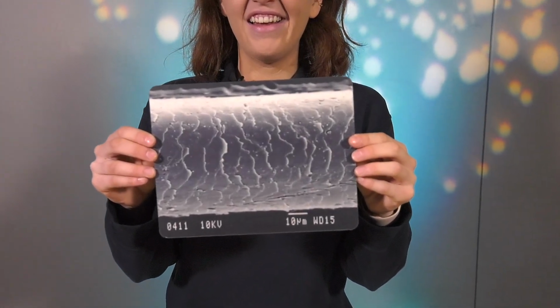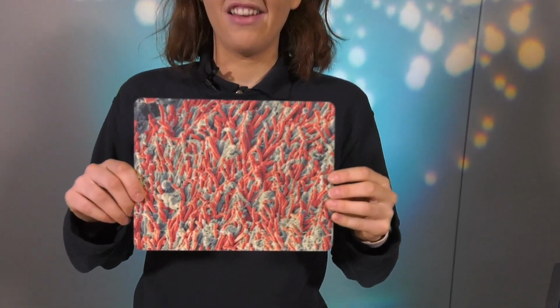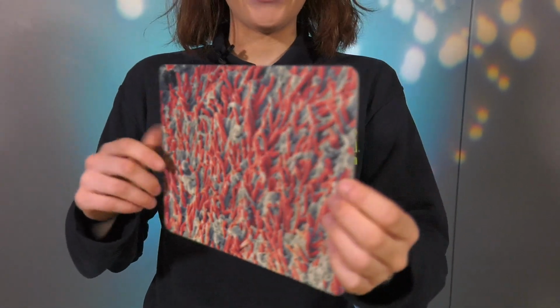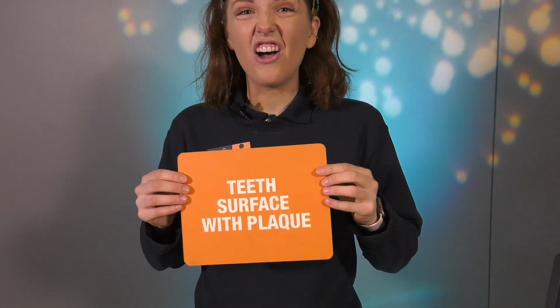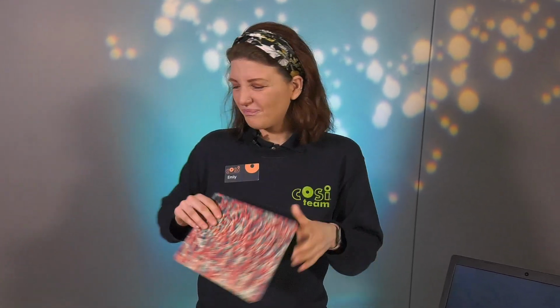All right, I'll give you another chance here. Let's look at this picture. What do you think this is a microscopic image of? It is hair. All right, last one. Let's try this. Take a guess. It is actually the surface of your teeth, but with plaque. If this grosses you out, that's why it's a good idea to brush your teeth.